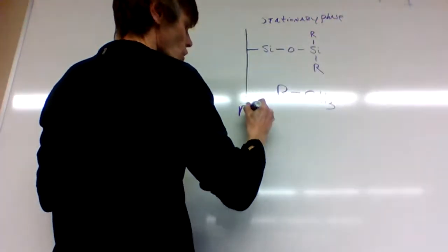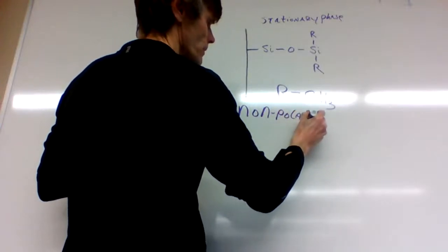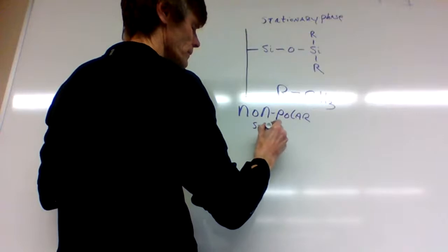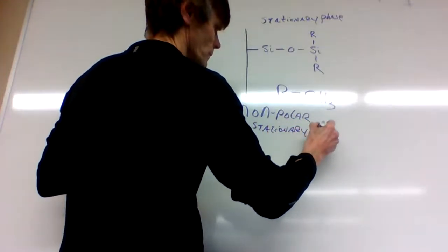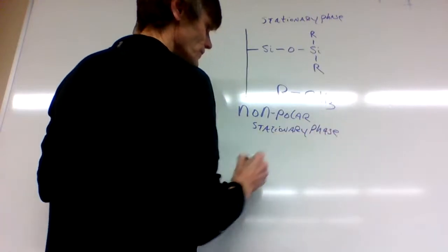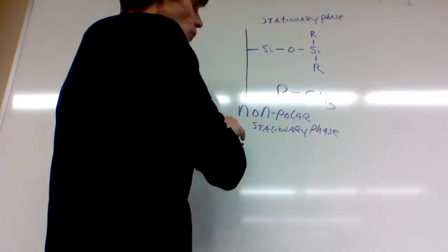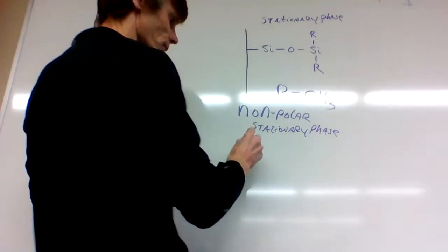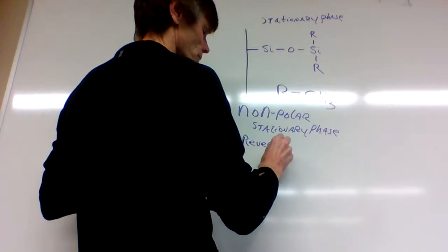If we have a non-polar stationary phase, for GC, we're only focusing on the stationary phase. A non-polar stationary phase is what we call reverse phase chromatography.